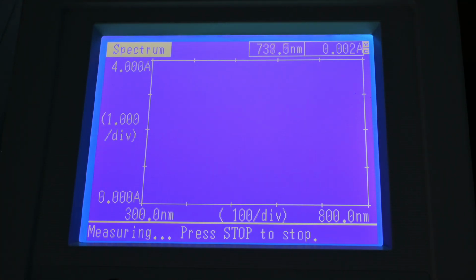From this, we can tell it's orange because the absorbance is in the range of 200 to 620 nanometers. The gap in the visible light spectrum absorbance corresponds to the range of orange. We see color by seeing its reflection. What we're looking at isn't actually the color we see, just the kind of light that it's reflecting.